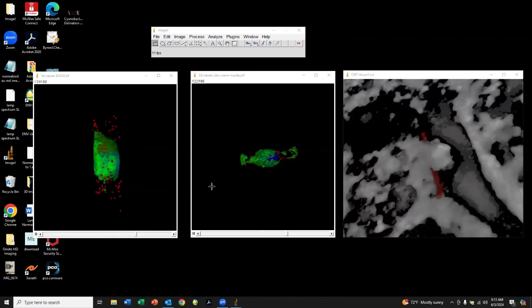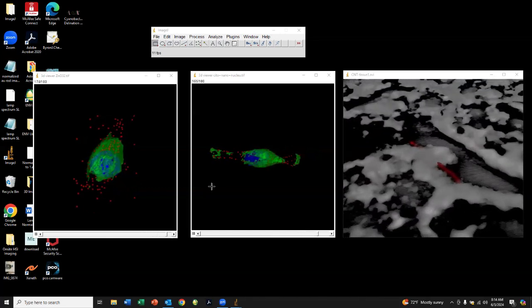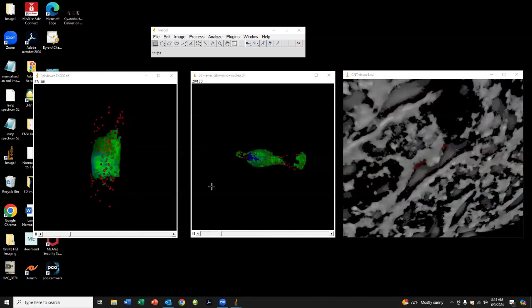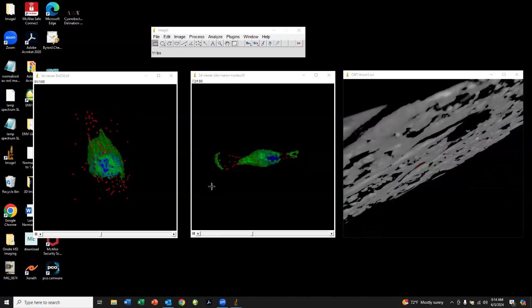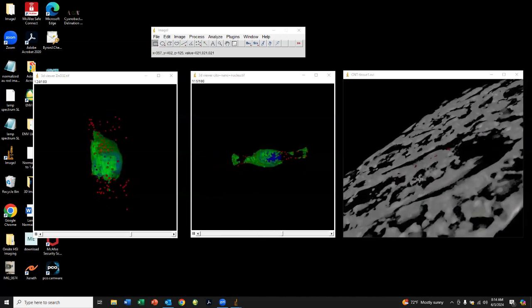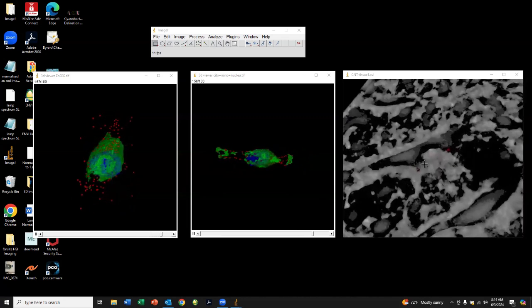The deconvolution is not quite as crisp as it is in the fluorescently labeled cell structure, but clearly you can see the red pseudo-colored carbon nanotube that's internalized in this tissue structure, this lung tissue structure that you see, which is shown, it looks red here in this image coming around.